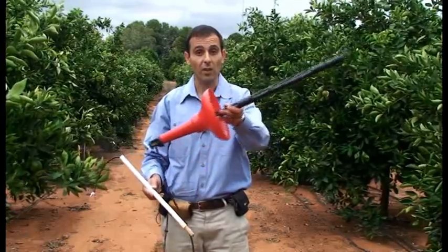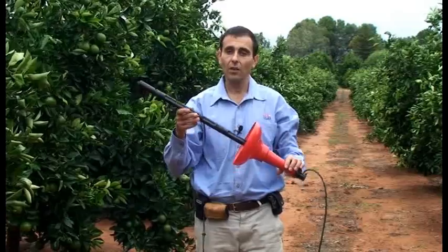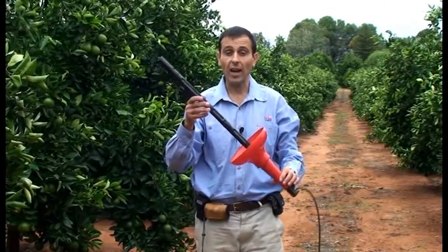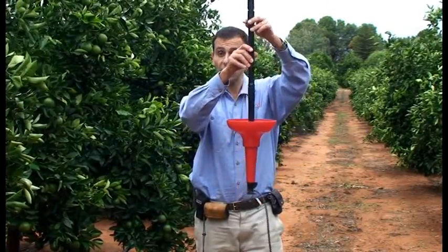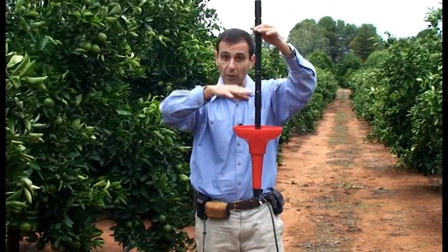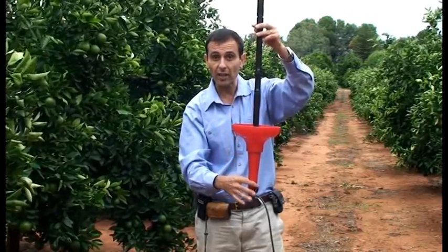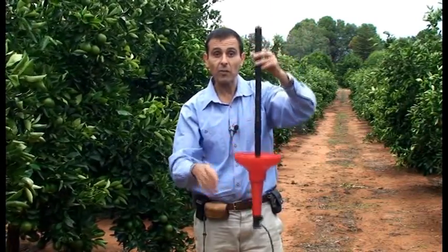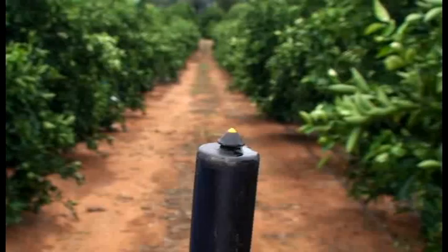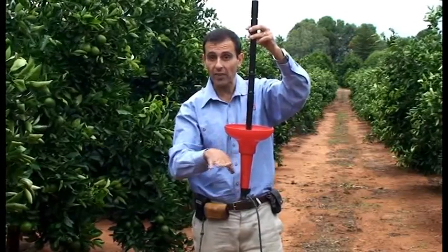The first method is the wetting front detector and the second is the ceramic sampler. The commercial model of a wetting front detector is the Full Stop, and it's a type of funnel that's buried under the ground. As soil moisture moves down the profile, it concentrates in the funnel, moves down the channel, and fills the reservoir. When the reservoir fills, a small indicator at the top of the unit pops up.